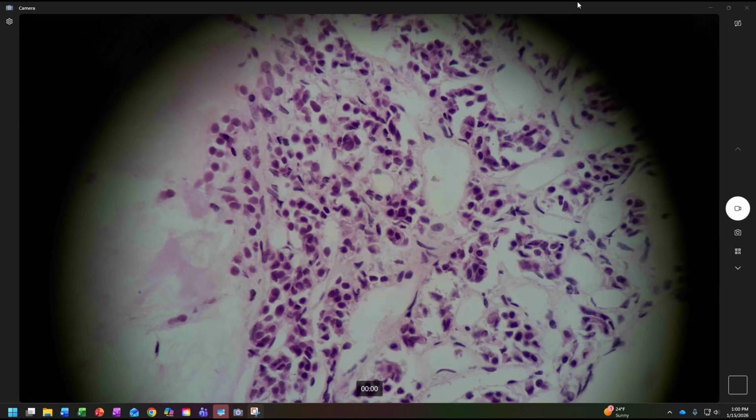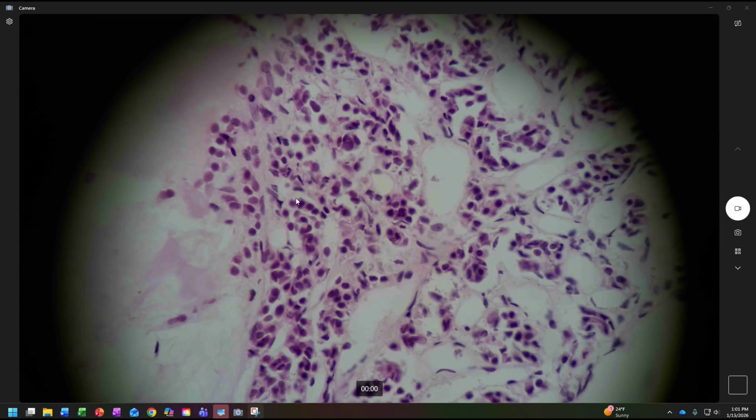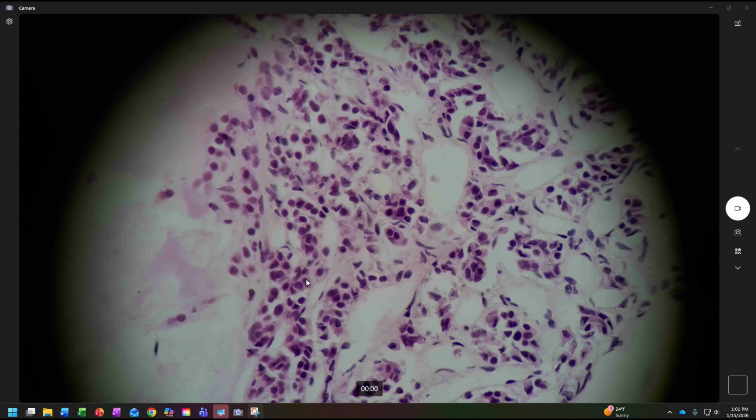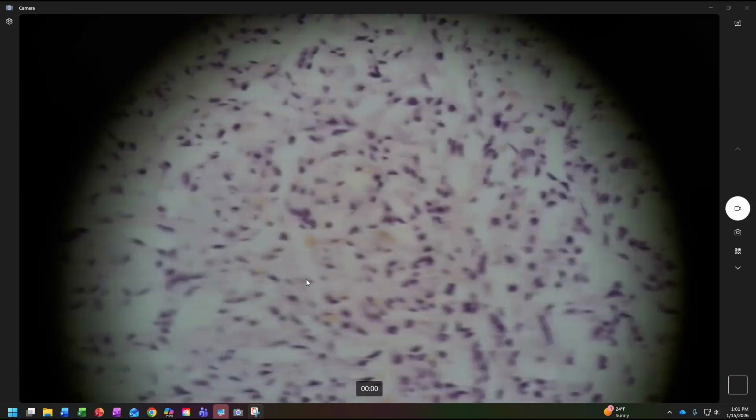So I think this is our dividing line here. Here we're looking at the anterior pituitary gland side. Notice all these are cells. The dark is the nucleus of the cell. This light area is the cytoplasm of that particular cell. I don't know what all these spaces are, but again, the cells are cuboid in shape. Remember, cuboid means about as tall as they are wide. And then if we go over to the left, we just grabbed the wrong one.